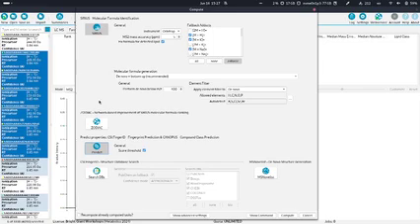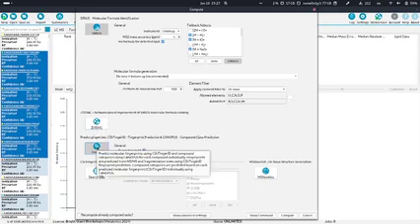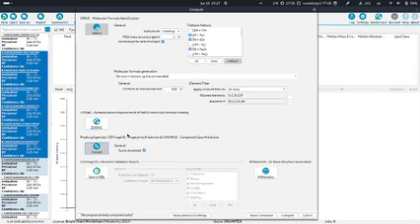Everything we did up to now, so SIRIUS, ZODIAC if we toggled it on, and the predict properties, is all de novo, so we can also get hits which are not in any structured database. But in many cases you want very specific structure hits, and to do this, we now toggle on CSI:FingerID structure database search.